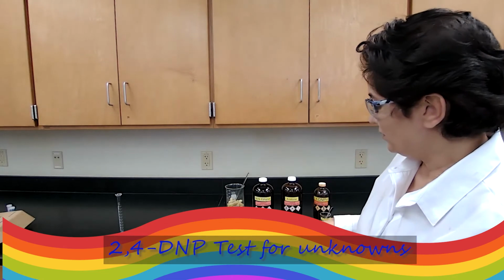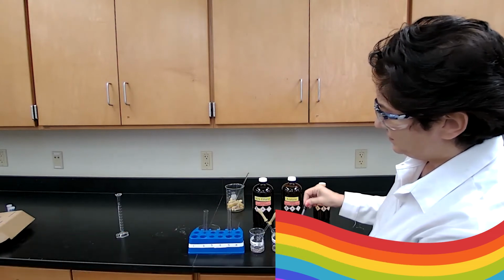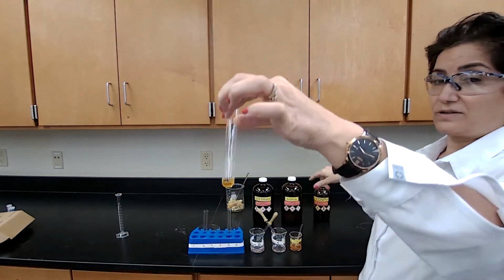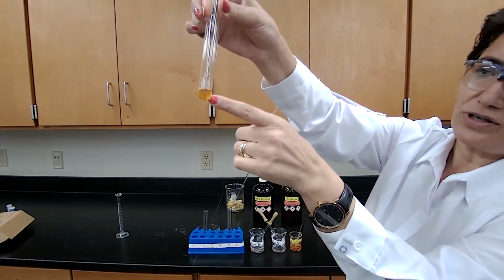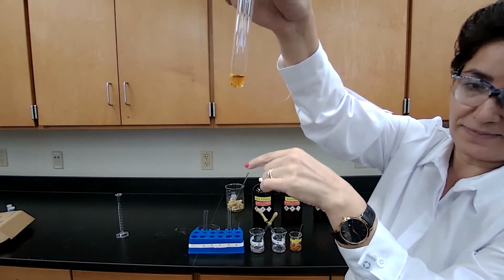To the unknown A, I will add the reagent, the 2,4-dinitrophenylhydrazine reagent. And I want you to pay attention to the transparency. It's not colorless, it's yellow color, but it is transparent.